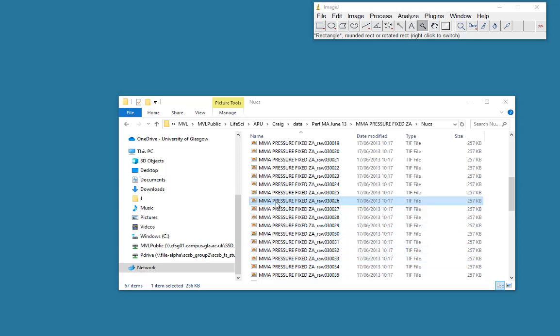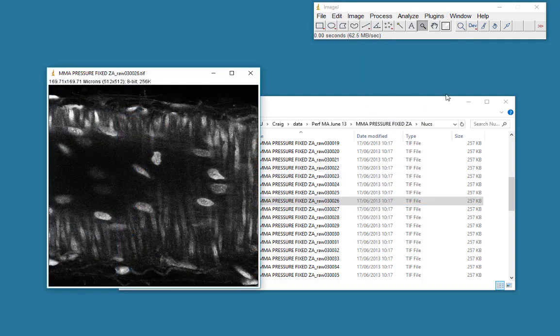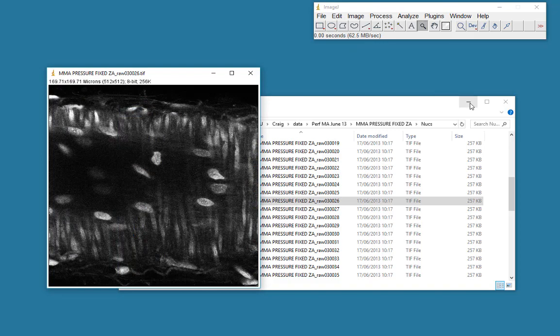So the first thing is to pick a suitable image. I'll just drop this onto ImageJ and I'll minimize this.